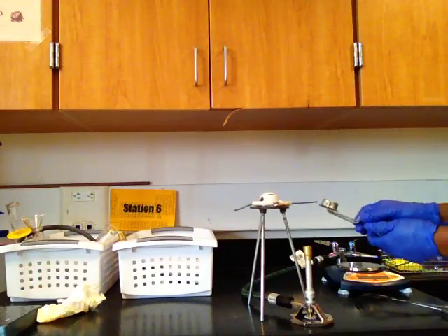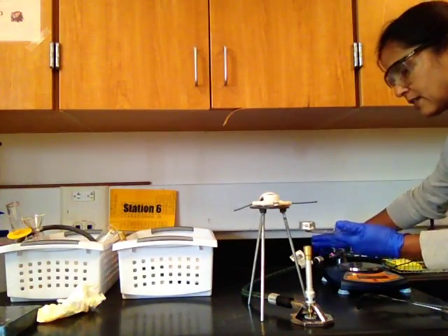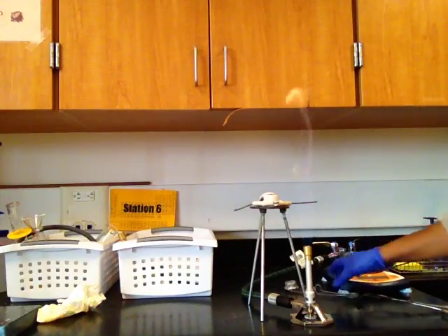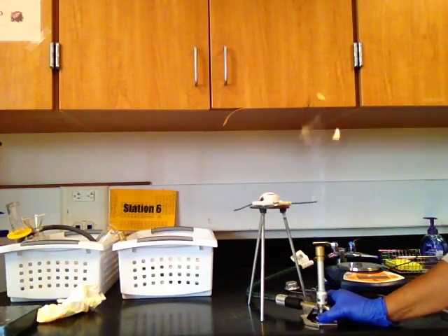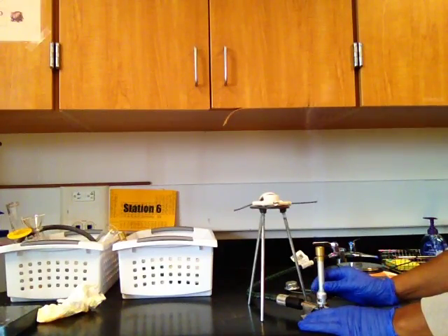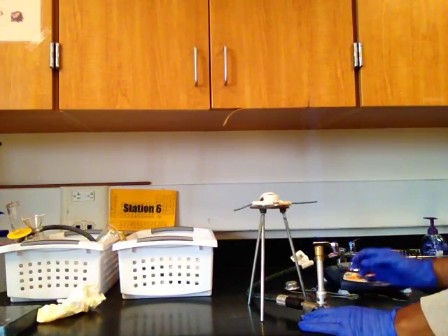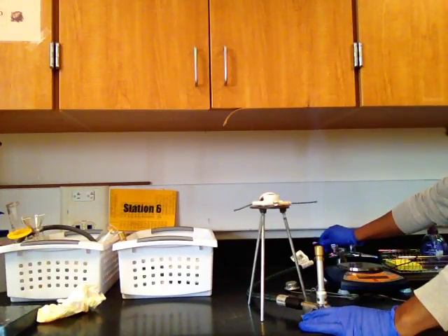These are the strikers, and you turn on the gas, and you get a nice blue flame. If your flame is red, as you see here, adjust the air to make sure the flame is completely blue, because the red flame produces soot and it will deposit on your crucible.